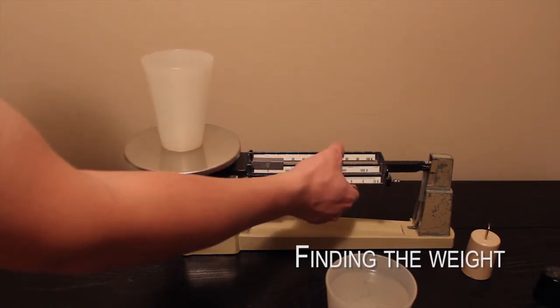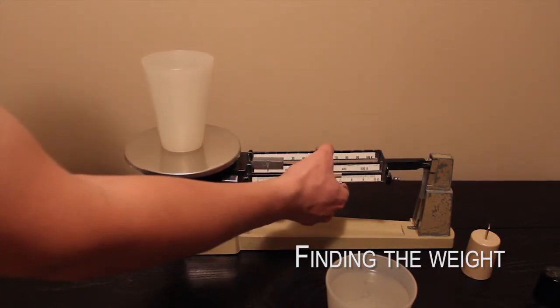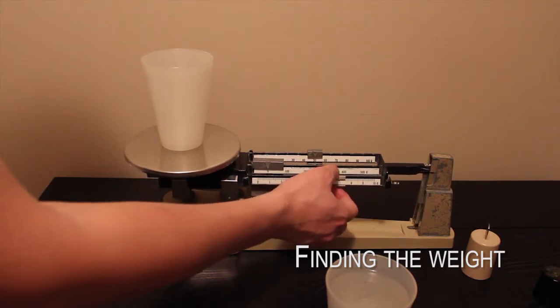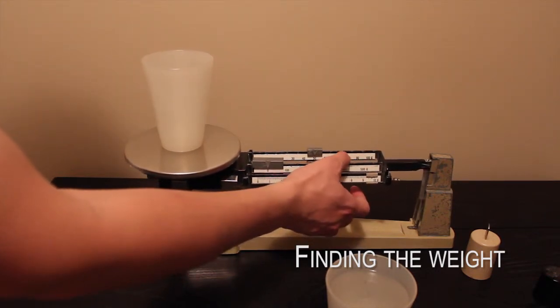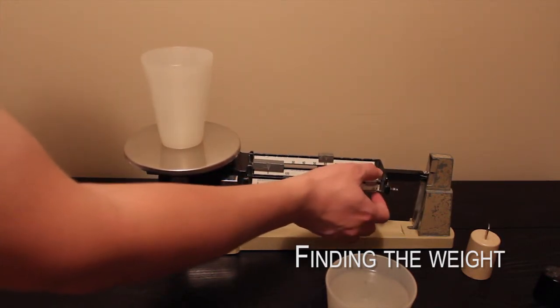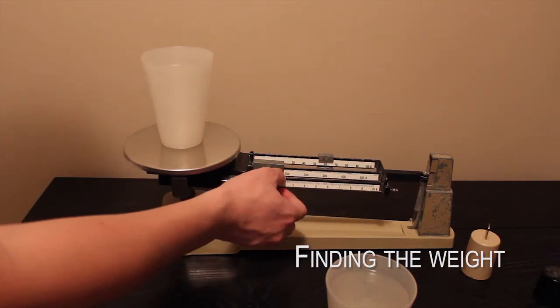Next, move the back horizontal beam's 10 gram weight, and adjust it until the balance pointer drops. Once it drops, move the weight to one level back on the 10 gram graduation.